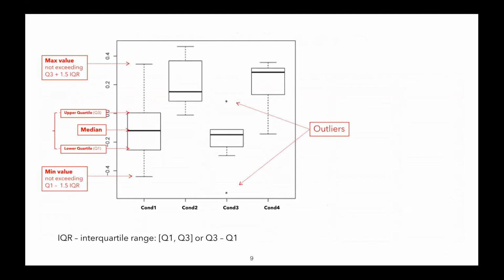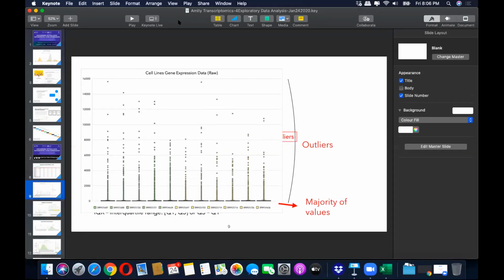To do so, we often use a box plot, which shows how all the values are distributed between samples. So this is an example of a box plot. If we have multiple data sets, like different samples, different conditions, in our case the sample data of gene expression with multiple samples, a box plot helps compare the samples using statistical properties such as the mean, the median, and the bulk of the data. So we are trying to look into the mean and the median. For example, here, it's a big data.